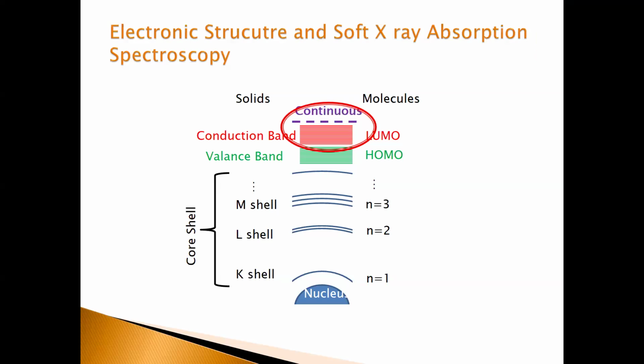Okay. We didn't try it. Actually, we can do it. Our neighbor, the X-ray absorption spectroscopy XAFS beamline, they have a spectrometer, and we can do this actually. We didn't try it. If you have interest in this, we will get in contact. We will discuss this. We will try to arrange something, and we will try this. Actually, it can be done.